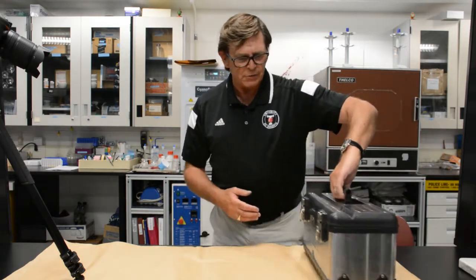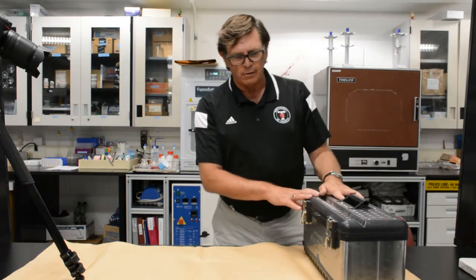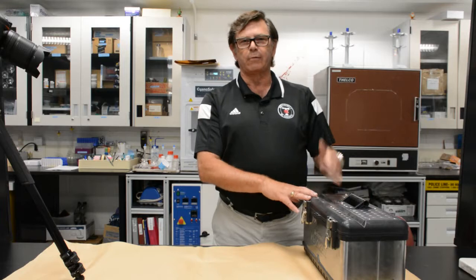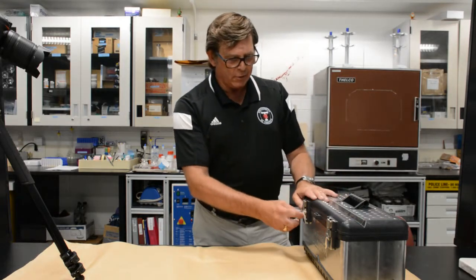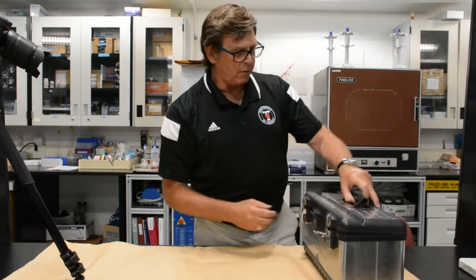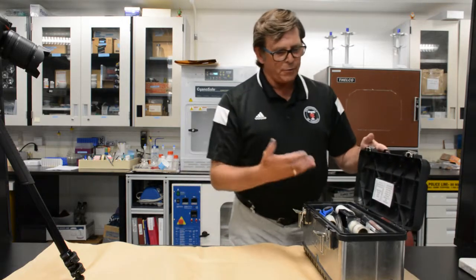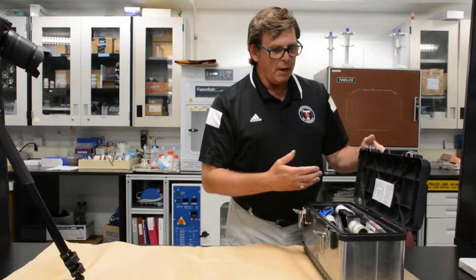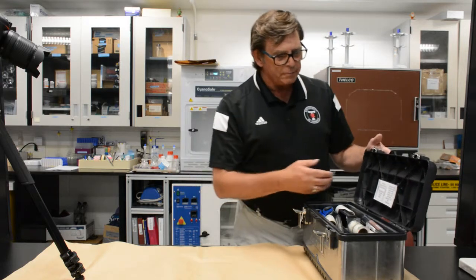through the kits themselves. This is basically a standard stainless steel toolbox that we're using for fingerprint development. It's a fingerprint kit, so it has the general supplies for processing a crime scene and certainly for using it for our purposes in-house. We'll go through the contents of the kit. It has double latches on it. It's easy to clean because it's stainless steel.